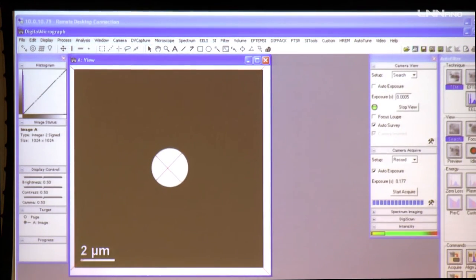So something wobbles that side, so I need to correct it. I will try to correct and make sure that the wobble is along the optic axis. So now it wobbles in this direction. That is wrong. I need to go in the other direction. So now it's going in this direction. That's wrong as well. I need to come into the middle.